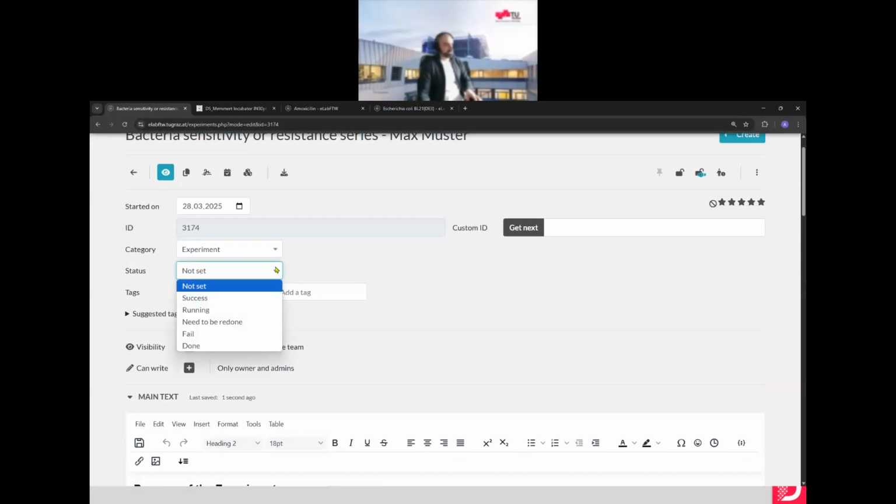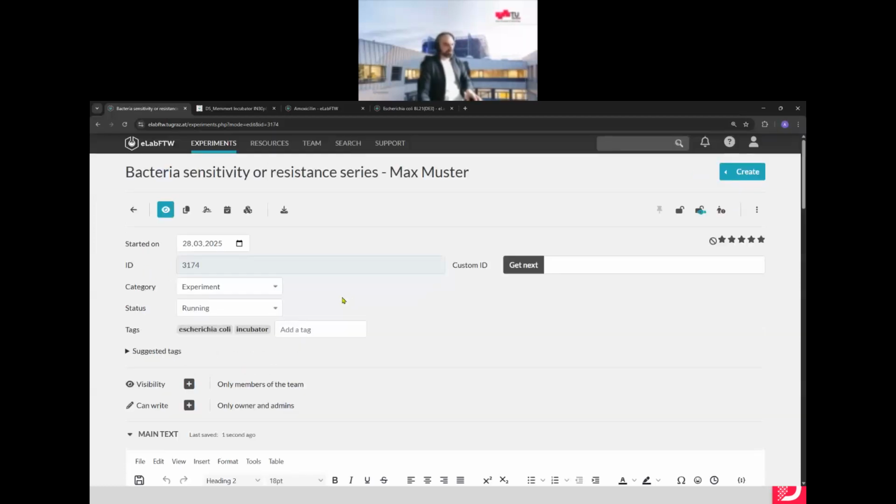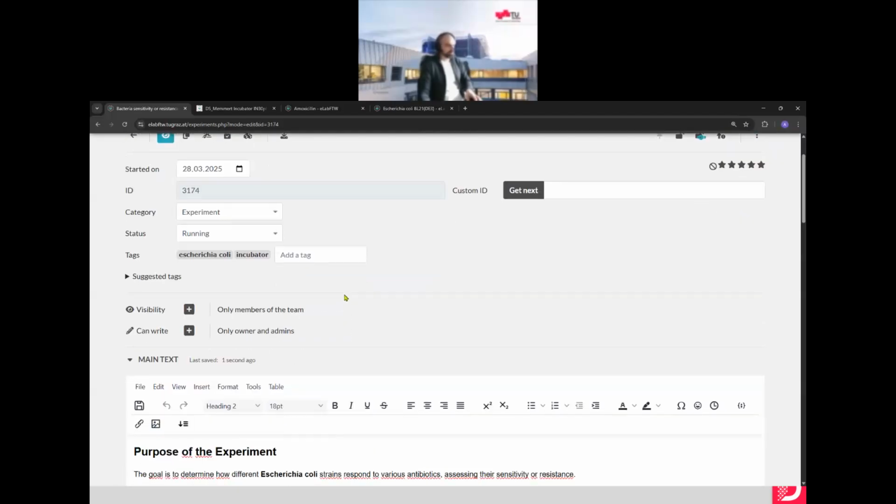I can also say onto the statuses, I will start tomorrow, but I can actually put it on running. I can also maybe want to add a certain tag. I think it's not necessary to do it right now. I could do it anytime, so maybe I will do this later.